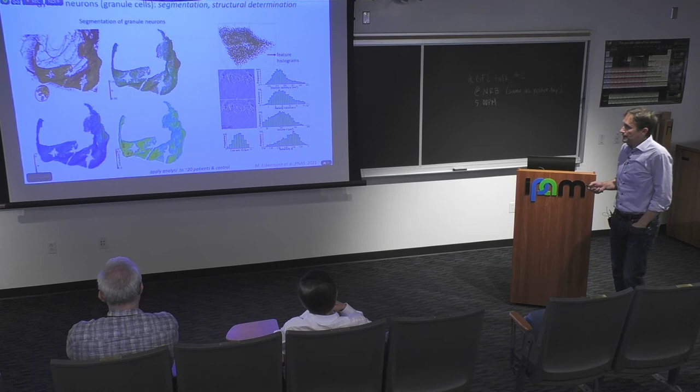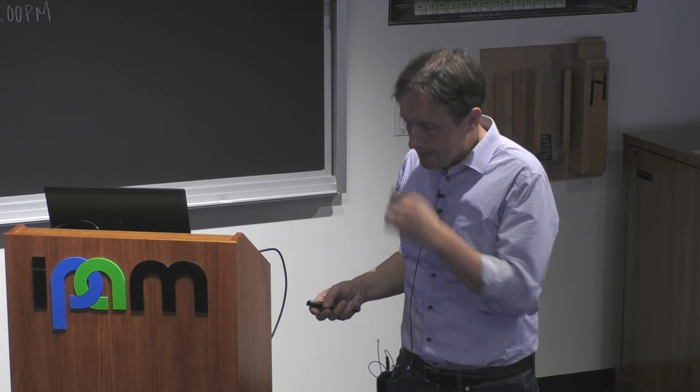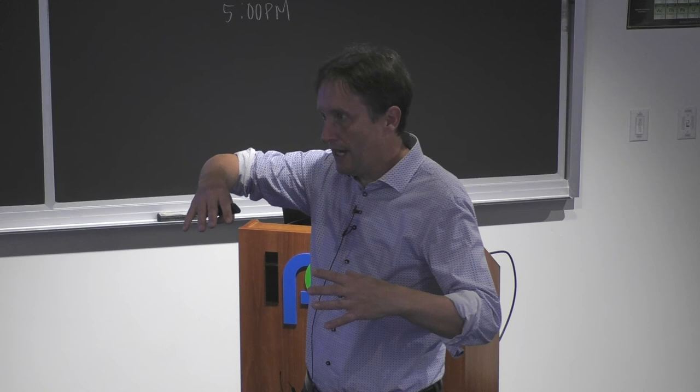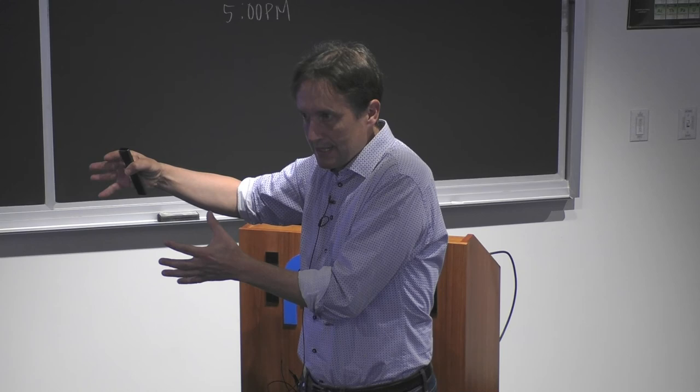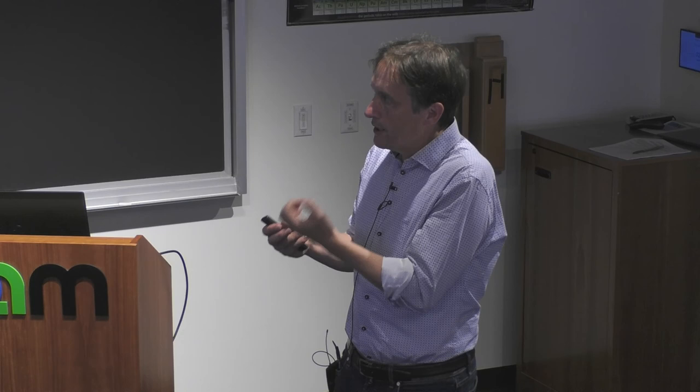And then each subject would correspond to a point cloud with all the respective cells represented, and then we ask how much does that differ between different individuals. So rather than t-testing any median or mean values, we take the entire 3D distribution, but not in real space, but in feature space. And of course, real space metrics could also be a feature, like number of nearest neighbors and so forth. We also exploit this. And then we want to see what are the differences in a certain number of subjects.